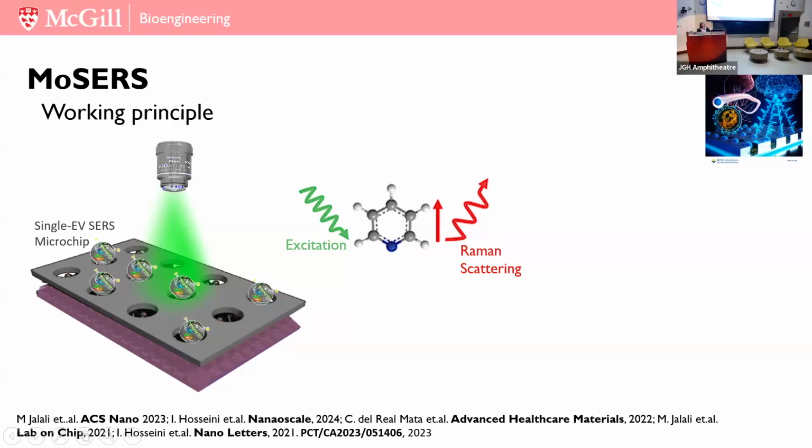What I'm going to talk about right now is a very non-traditional way of looking at EVs. What we developed to tackle EVs is a nanoarray platform that uses the magic of smart nanomaterials. By using this platform and capturing EVs at the level of the cavities, we can fingerprint them by using what we call Raman scattering.